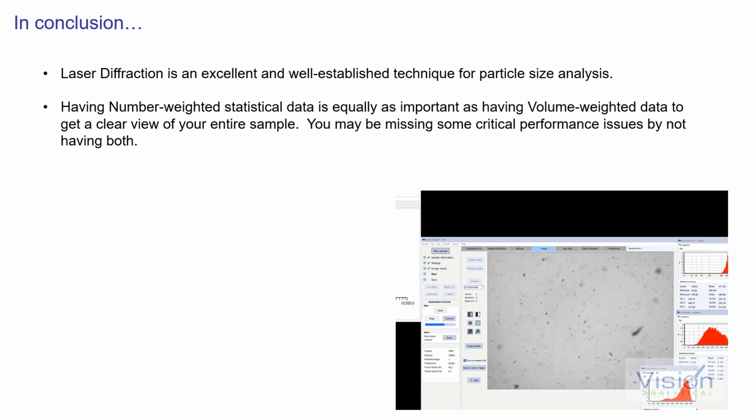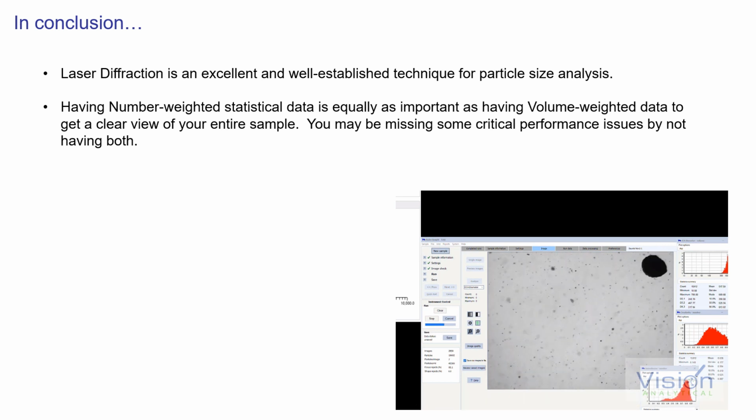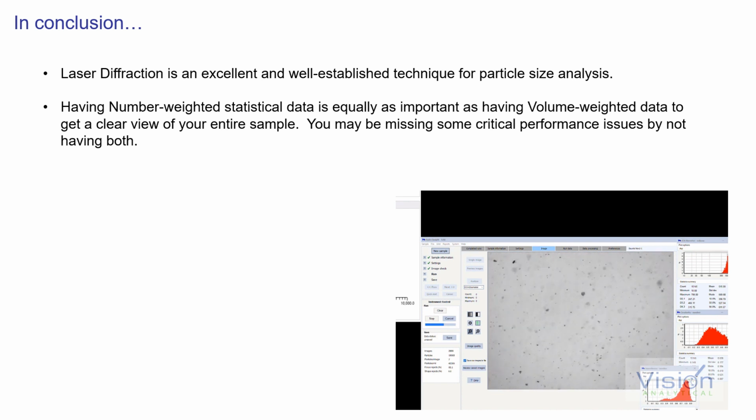In the case of this application note or case study, the rheological differences were brought about by these tiny particles that were not being observed by laser diffraction. It was a very interesting observation that the customer noticed and realized that these small particles and their presence, even though not detected by sieving or laser diffraction, is what was affecting the rheological properties of the suspension of these particles.